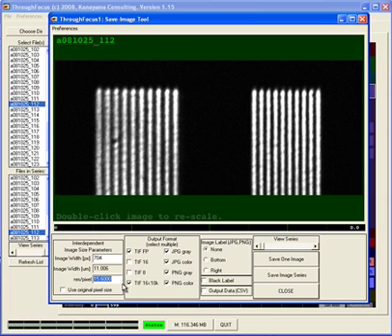Now, we can change it so that we have more pixels coming out than the standard. So standard would be about 15 or 15 and a half. I'm going to set this to 7.5. Just a second. 7.5. And then you can decide here what kind of output you want.